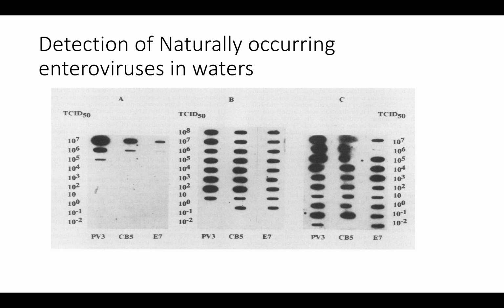So RT-PCR was the most sensitive procedure, which means that it was the best procedure for the detection of naturally occurring enteroviruses in water. The only drawback that I can see from this experiment is that there were no quantitative results for the RNA present in water.